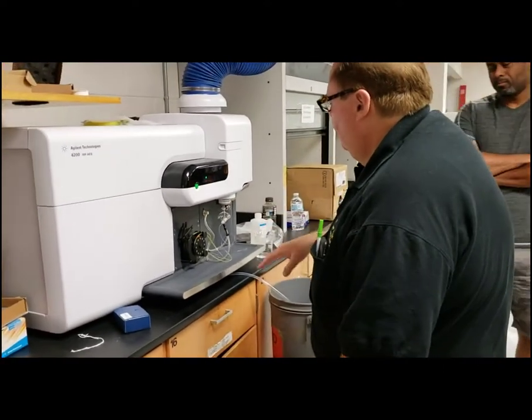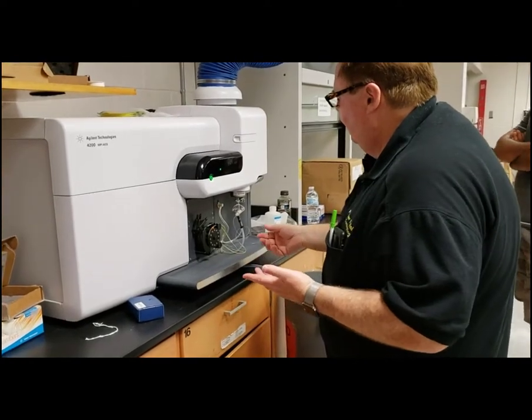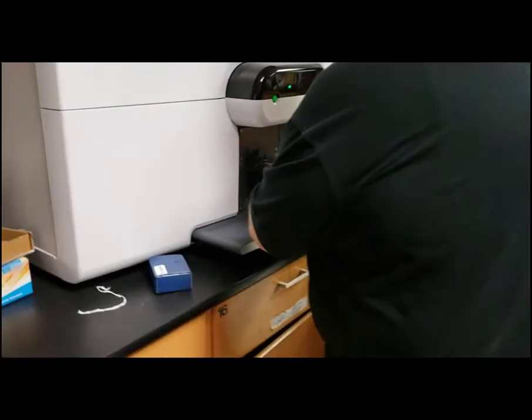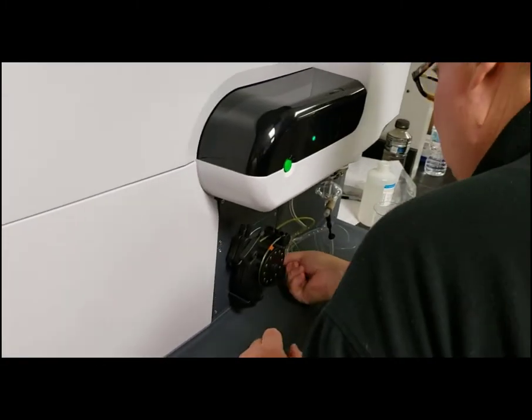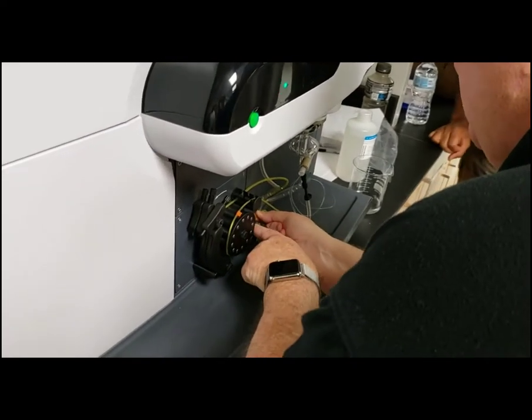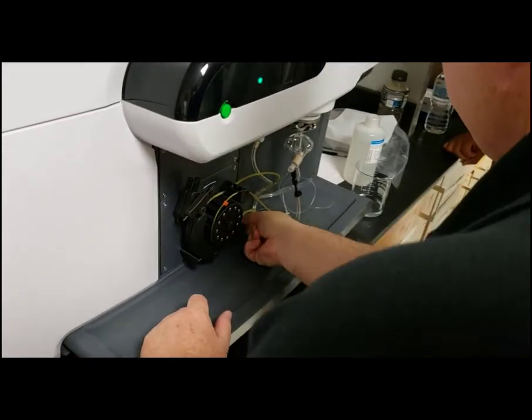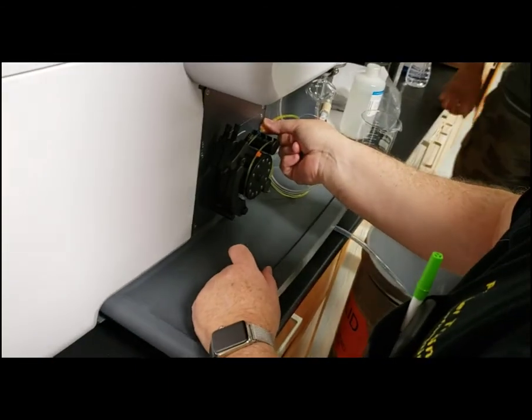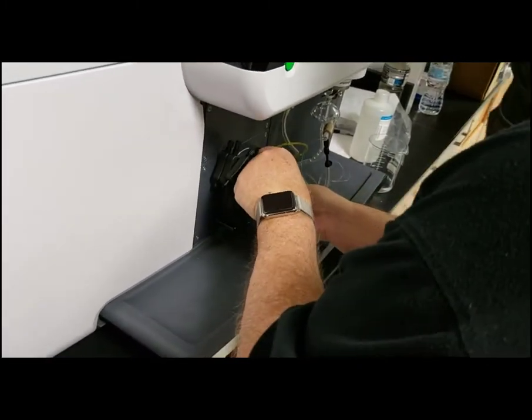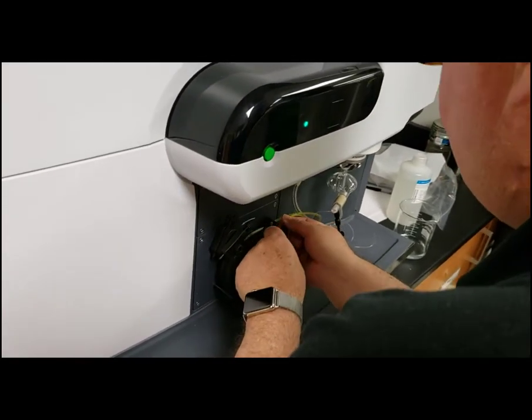All right, so now that we went through those, the last thing we want to do before we light it is to take the peristaltic pump tubing and stretch it into the cavity. So you take a look at it. There's 2 cavities, and there's these tabs. You want to make sure the tabs are facing up. Put this one in the cavity with the tab up. You don't want to twist it. Same way down here. This one is in that one, and then we stretch it over to this one.